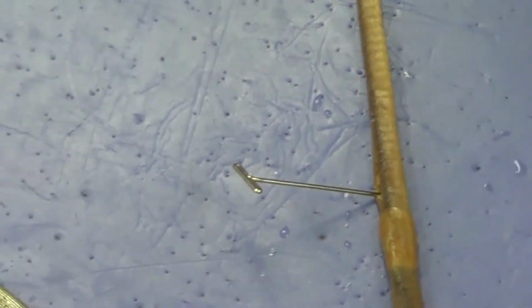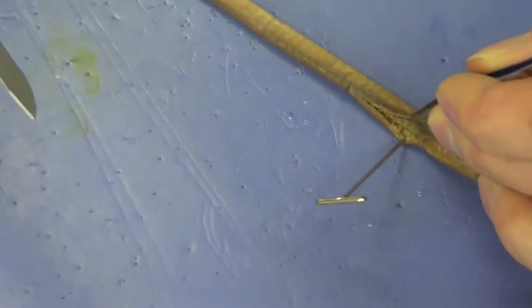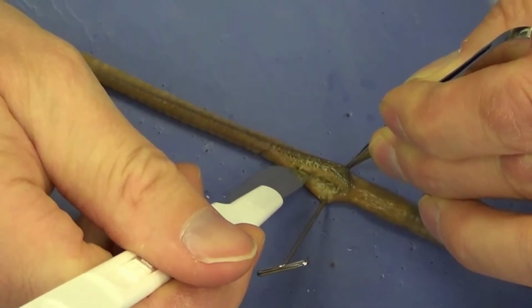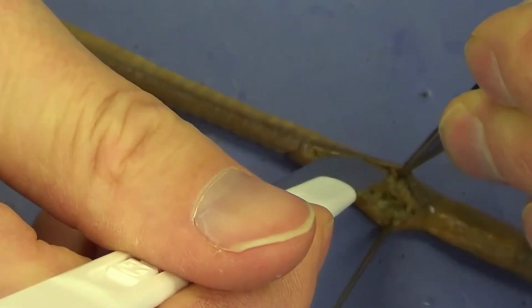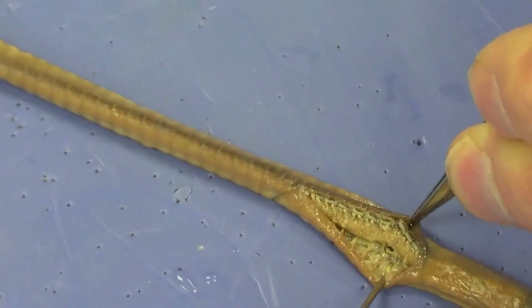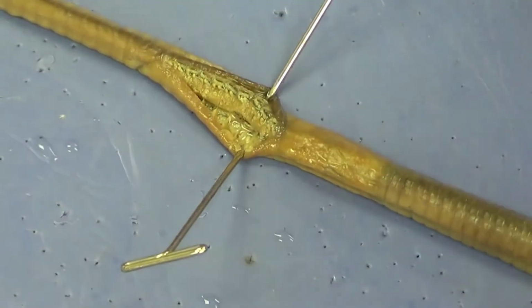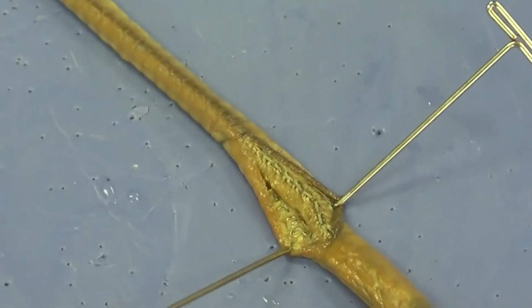So I've pinned one side of the skin, and I'm going to turn the earthworm just a little bit, and I'm going to pull that skin back. I'm going to sort of tent it up. And you can see the septa start to appear. And I'm going to cut those septa because that's going to release the skin. And I'm going to be very careful to not cut the intestine. If you cut the intestine, you're going to see some black material ooze out, and that is simply topsoil. That's all it is. That's a signal or an indication that you have cut too deep. That's about a 1/2 inch or so.